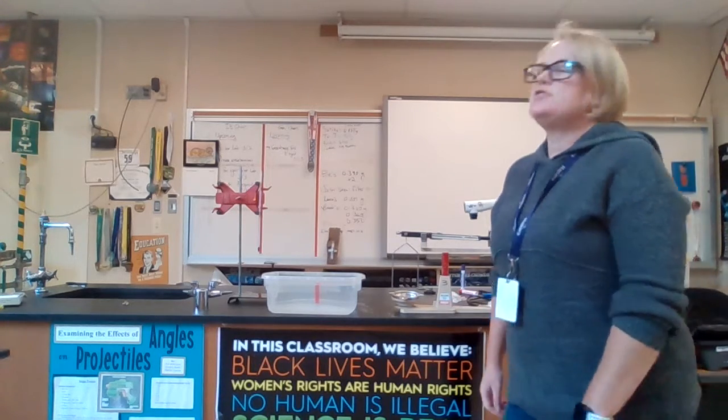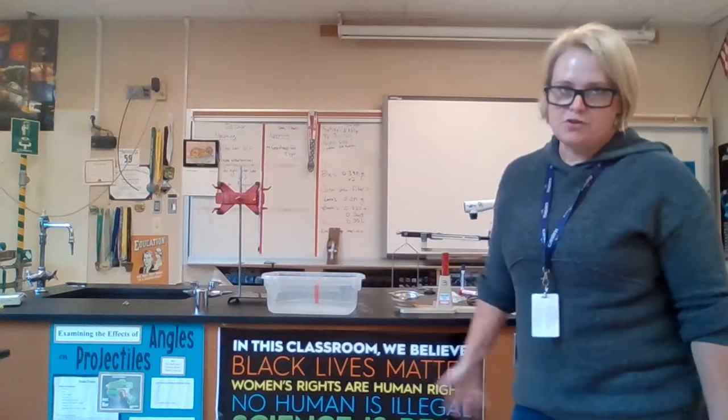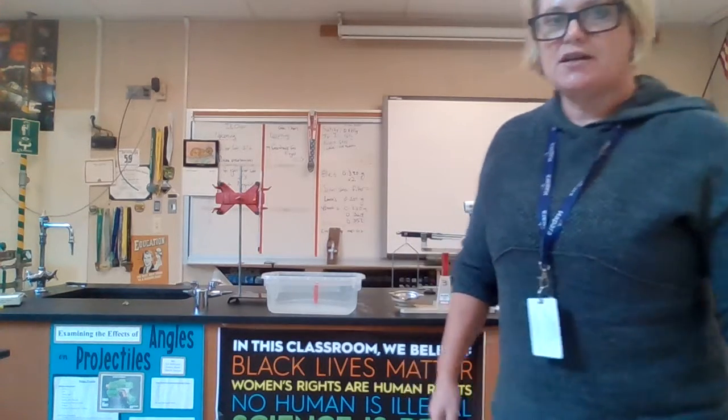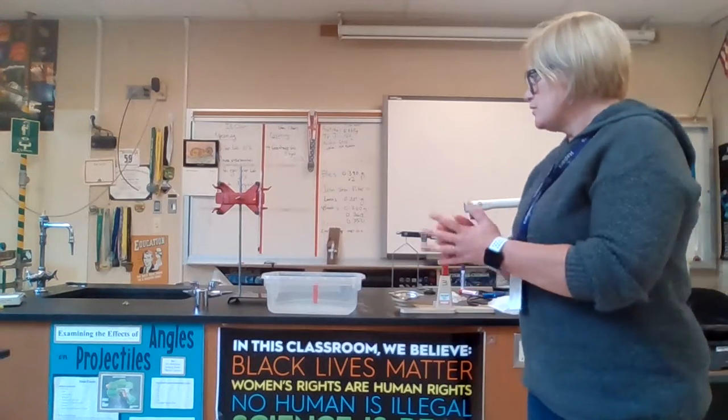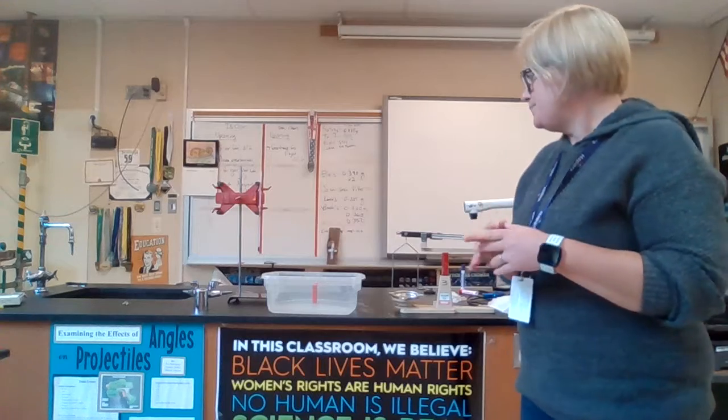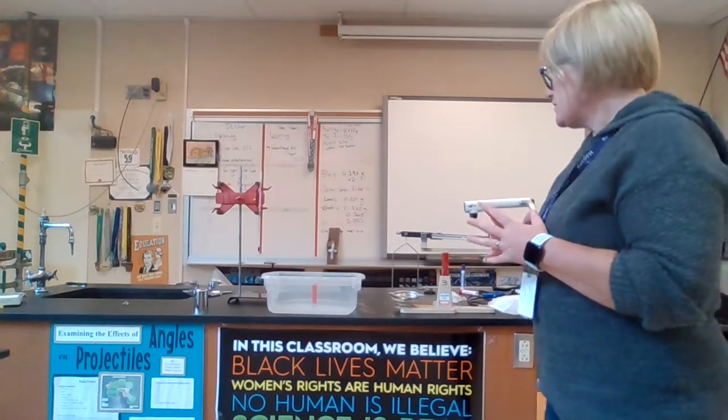It would be much easier if you could do it in the classroom with me here, but here we are doing it as a demo. I'm going to collect some data for you, and then you are going to process your data and write a conclusion. So the basic setup is this.